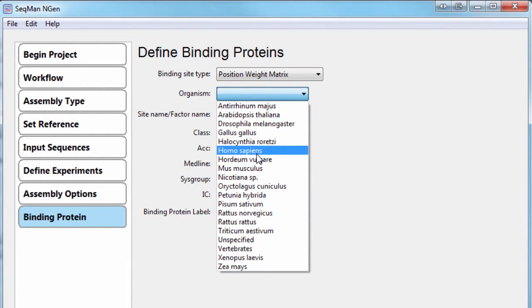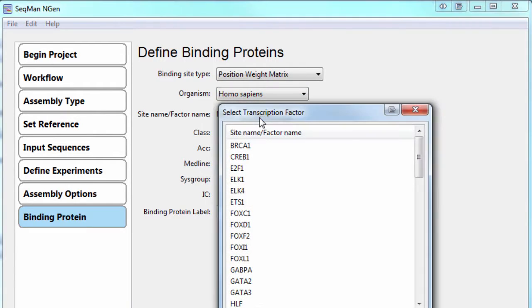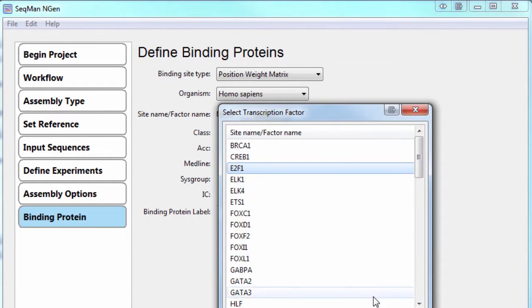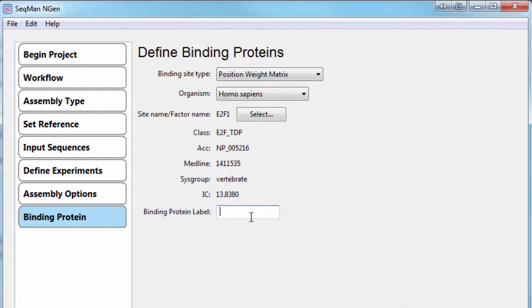Select Homo sapiens as the organism, and then select E2F1 from the transcription factor list. And I'll also use E2F1 as the binding protein label.